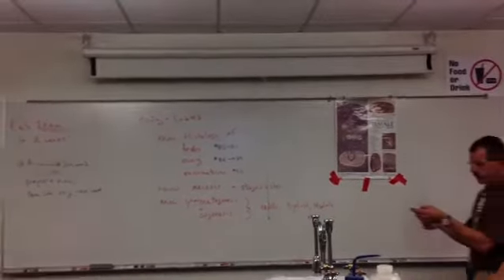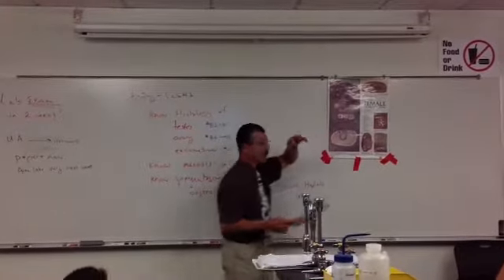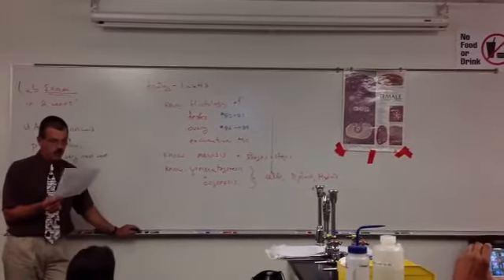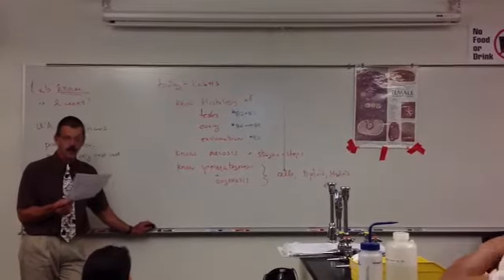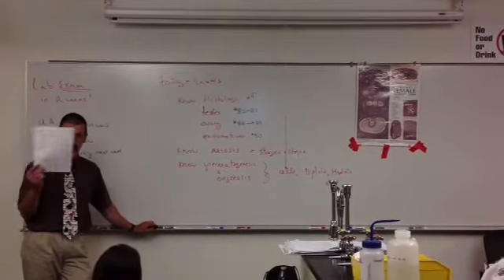So if you look at your list, way up here on the outside of the ovary, you have little teeny baby follicles that were there before you were born. What do you call those? Primordial, right? Follicles. What do you call the eggs inside a primordial follicle? Primary oocyte. So you have a primary oocyte in the primordial follicle.